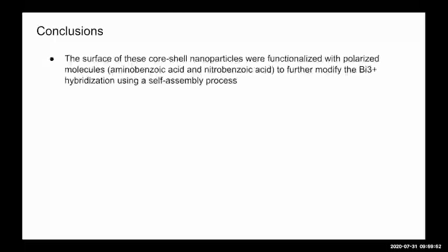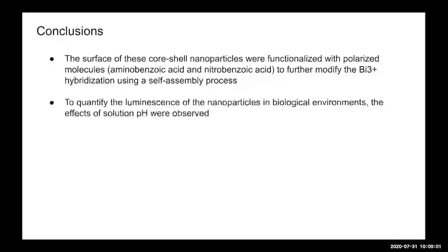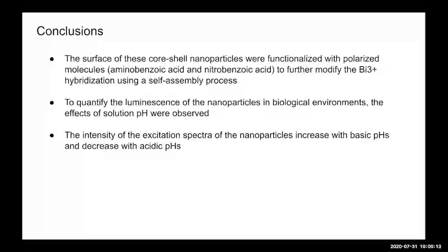In conclusion, these nanoparticles were synthesized and then functionalized with aminobenzoic acid and nitrobenzoic acid. In order to see how these nanoparticles would react in different environmental situations, the effect of solution pH was observed. The trend shows that at a more basic pH, the intensity of the excitation spectra increases, and at a more acidic pH, the intensity of the excitation spectra decreases.